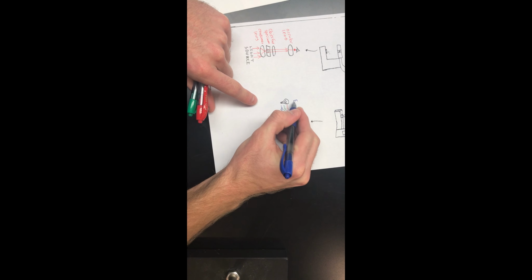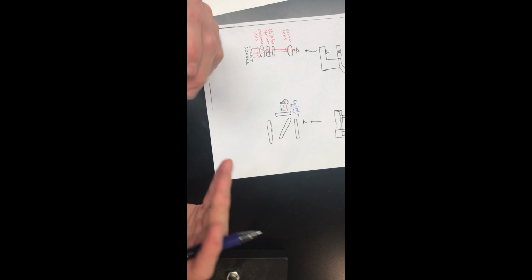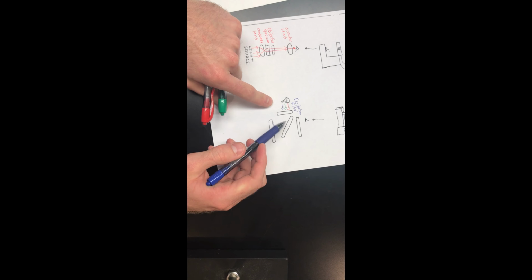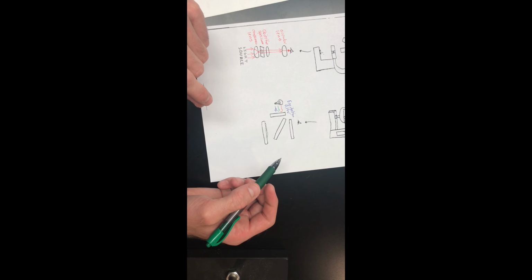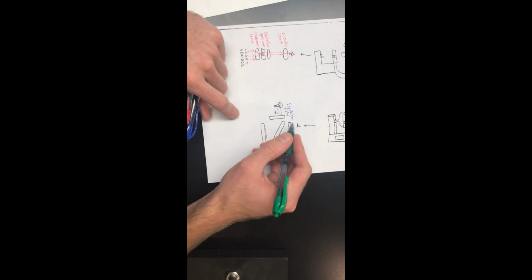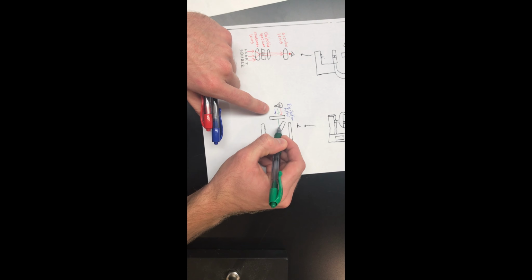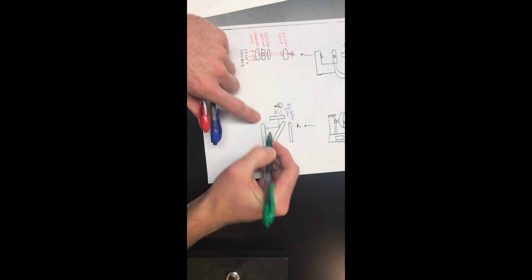This first filter is called the excitation filter. Each fluorophore has an optimal excitation wavelength. So let's say that the fluorophore on this sample is excited at 550 nanometers, which is going to be green light. This excitation filter will allow the 550 nanometer light to pass through and reach the specimen.